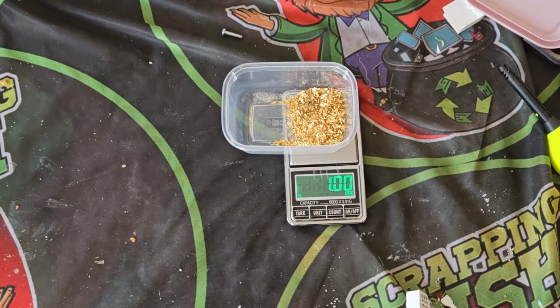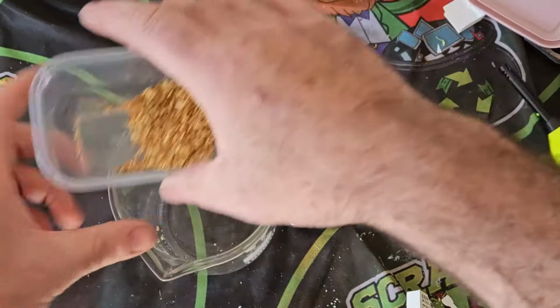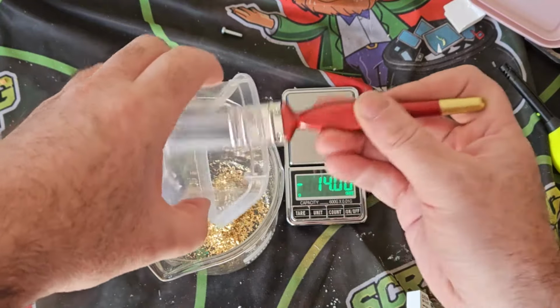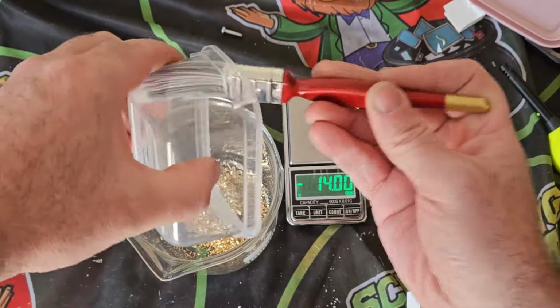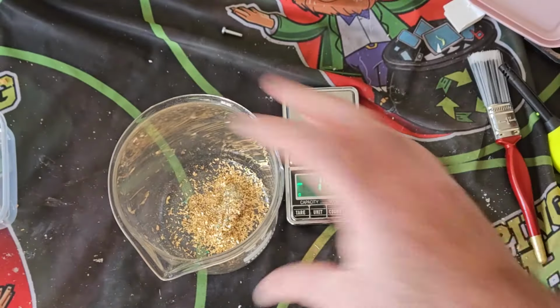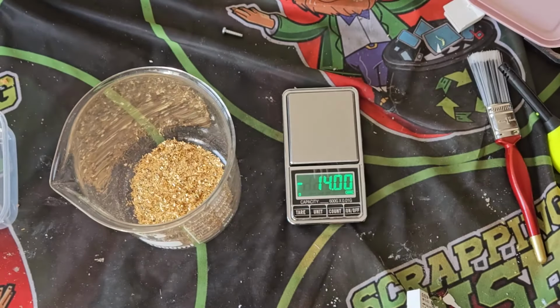So now the next part is we're going to put them back into this beaker, and we're going to add the hydrochloric acid. So again, that's nice and clean, nothing left in there. So yeah, we're going to add the hydrochloric acid to that and just our regular bleach.